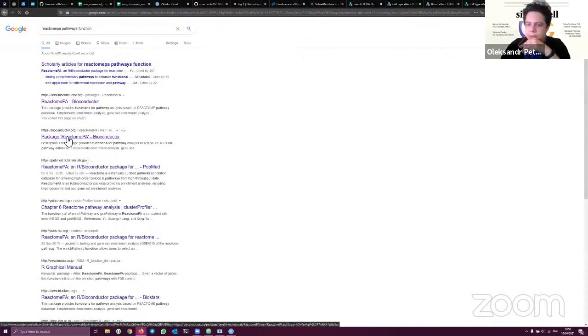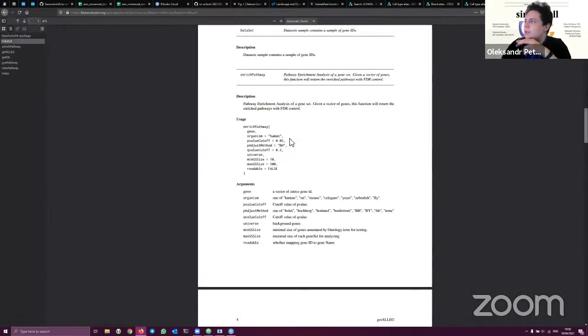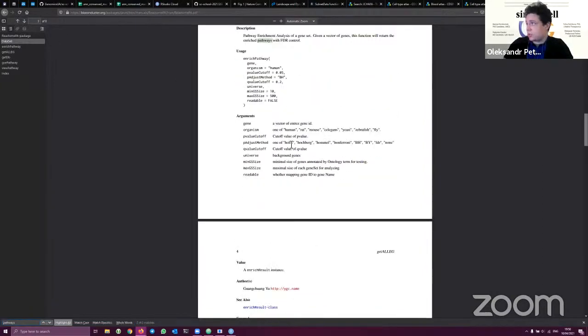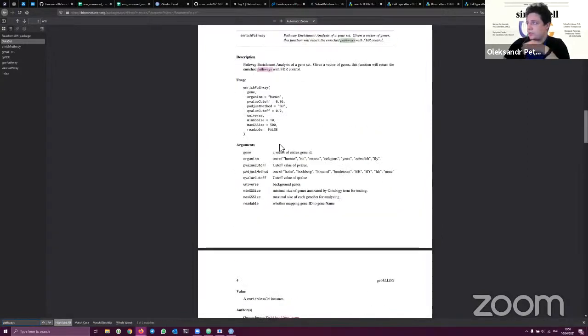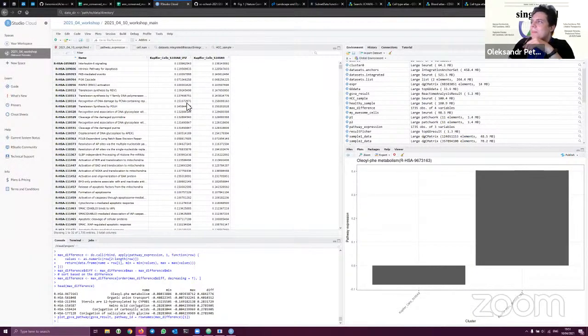Sasha, maybe I just understood Carolina's question differently. Like, what do these values literally mean? Did I understand it correctly? This is the score, and actually I found this description. Now I just need to find it. Basically, what I wanted to understand is how do we decide that these are highly enriched? Because I just saw 0.1 and so basically it seems low. I don't know what it is.